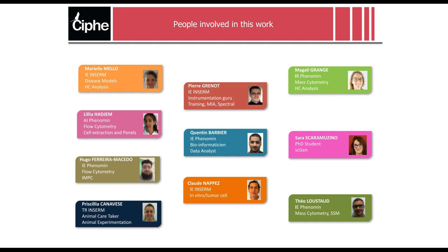For example, in the Self-EDIA consortium, we built a very big rat panel, but we don't have any knowledge about rat marker biology, meaning what type of cell expresses what type of marker. Doing the analysis collaboratively on a cloud solution allowed our collaborators to look at the data themselves and provide feedback, which I think is really the strength of the platform.